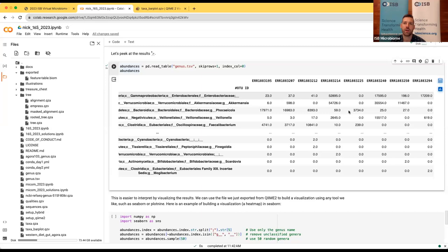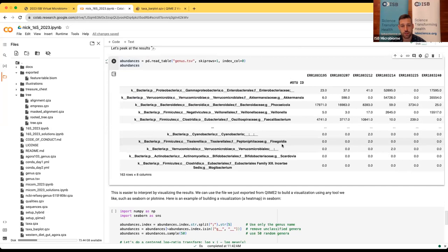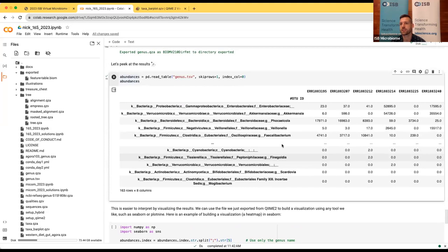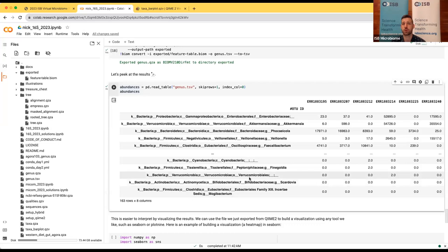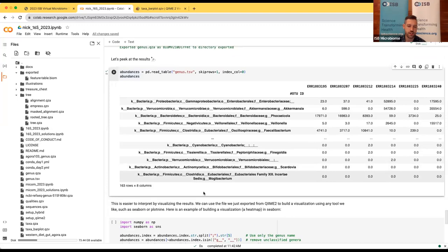Tomorrow, Alex will take you through a process of using data that looks a lot like this to build mechanistic models of the gut microbiome. Now that we've exported our data out of QIIME, we can apply it to additional packages or visualization tools — for instance, Seaborn or plotnine if you're more familiar with those.